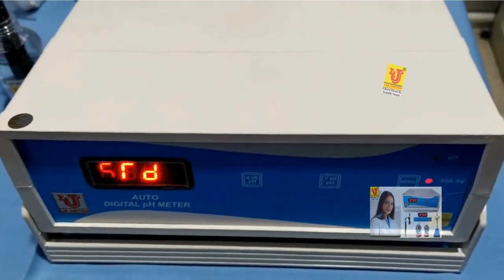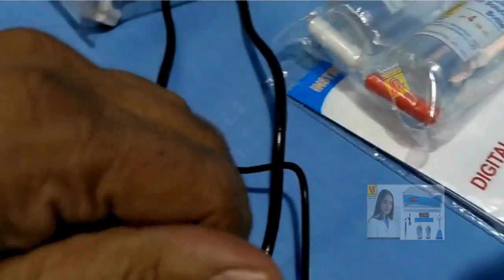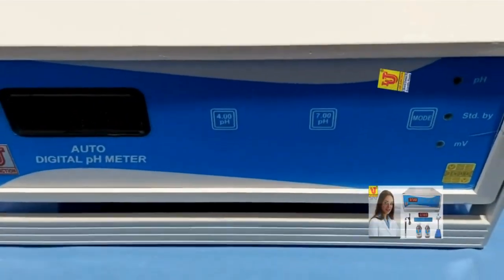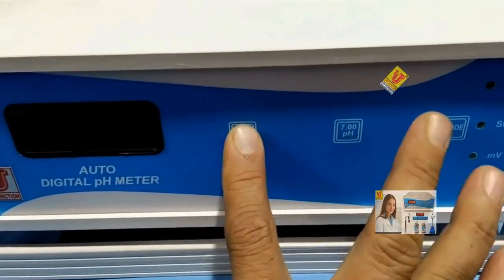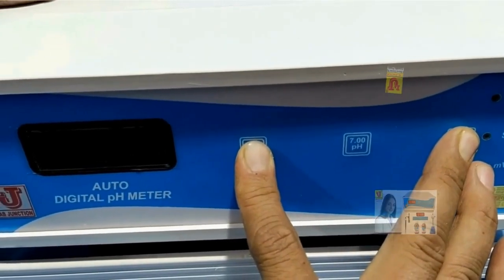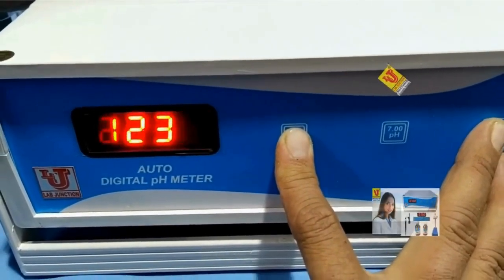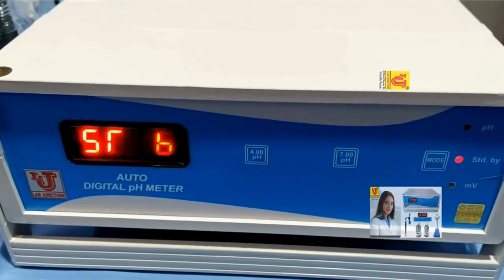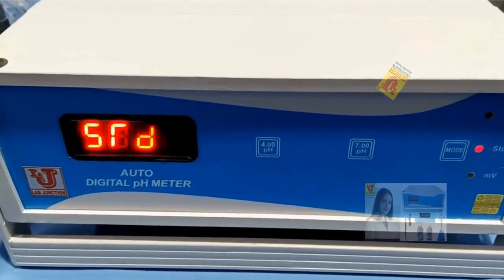Sometimes the instrument shows an error. In that condition, you have to switch off the machine and reset the instrument. To reset: press and hold both the 4 key and the mode key simultaneously, then switch on the machine while holding both keys. The instrument counts 1, 2, 3, 4 and the reset is complete. Release the keys — your instrument is reset. Now calibrate your pH meter again and check your results.